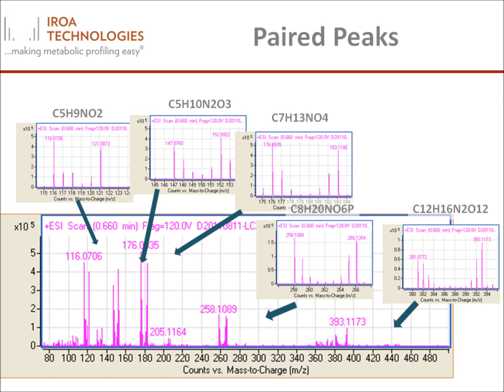Once an IROA peak is identified, it can be matched to the correct shape, which is confirmed by the other half of the pair. Note the carbon envelope shape of the molecule. For a more thorough discussion, please refer to the section on carbon envelopes.